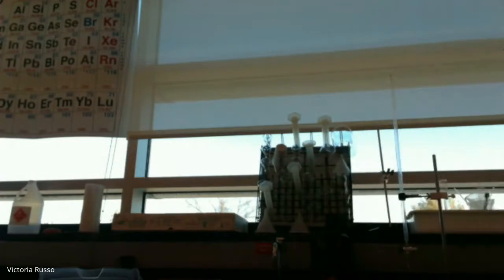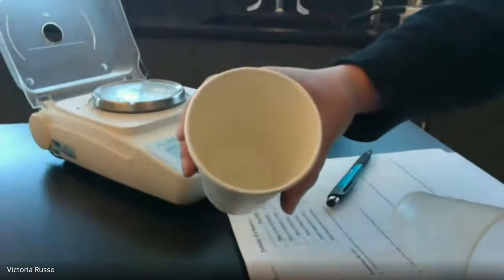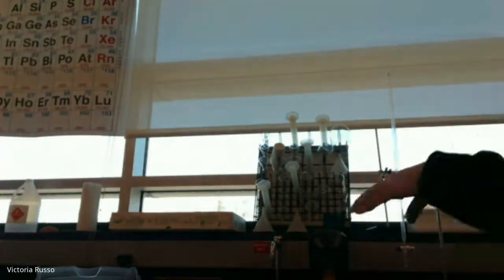I'm just going to quickly get a beaker just to show you what the reaction looks like naturally. And all of it is gone. If you look, there's no more. I don't want to pour over the computer, but let me actually move this down. So if you can see, there's no more metal in the cup. All the metal has reacted, which is what we wanted. It produces magnesium chloride, which is soluble in water, so you can't see it, it dissolves.